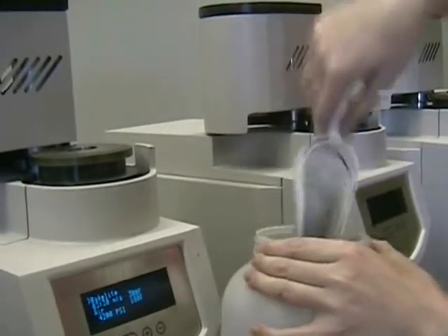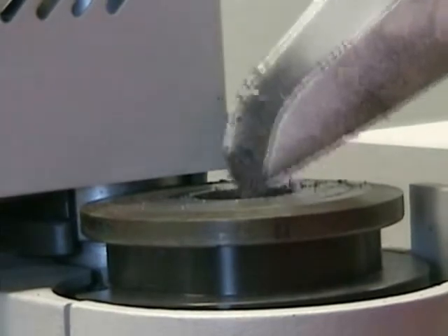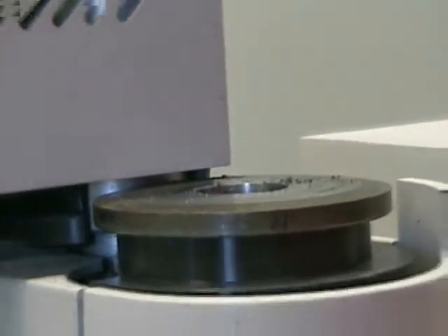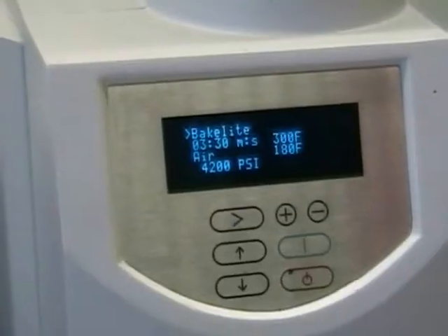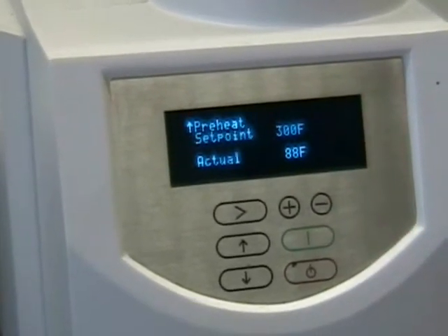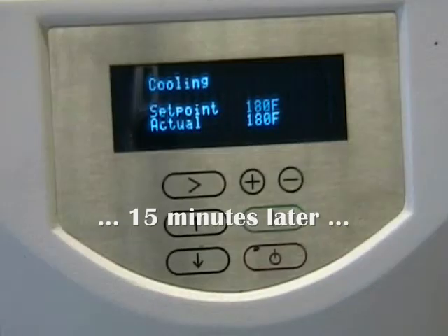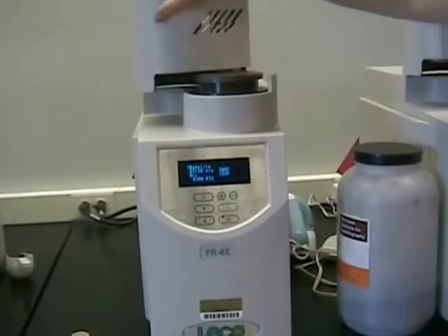Here the sample is getting lowered into the machine. This is powdered bakelite — it is a polymer and will polymerize when you apply heat and pressure. To start the process, you close the machine and then hit the start button. This process takes a while, about 15 minutes.